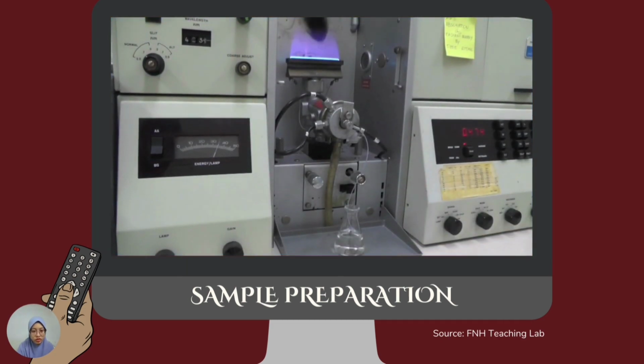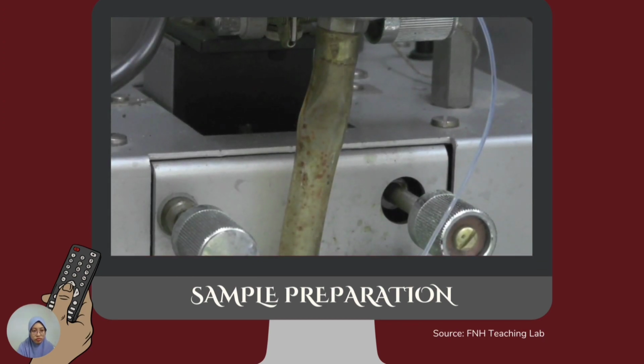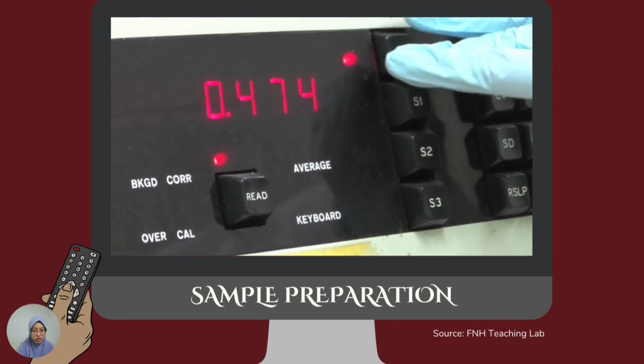Now the instrument is ready. Place the sample feeding tube in DD water first until there is a constant violet blue color. Pay attention if there is any leak around the sample slot. Zero the spectrophotometer by pressing the AZ button while feeding DD water.